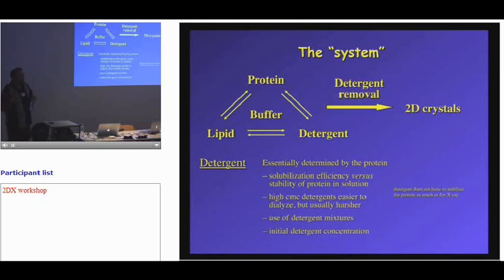But if we believe in the idea of these mixed micelles, the moment you actually add lipids to your protein, you already have lipids stabilizing your protein, so then why does it matter if you have a high... This is really the sore point. No, exactly true. We always were dreaming about experiments where you say, I have a lipidated protein, I have my detergent lipid micelle, I throw things together, leave it overnight. This is what we did all the time. And then we have this magic thing that we reconstitute the lipid ring. And if you don't have this, then of course it's a problem.